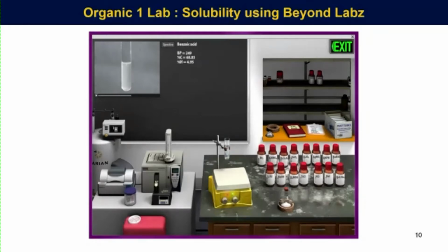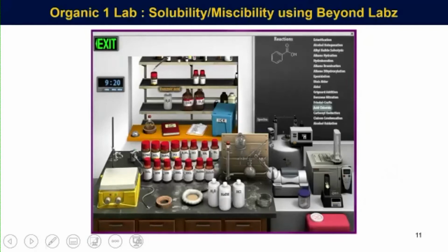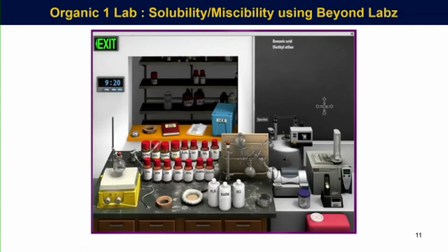And I think I'll be using something like this in the future to set them up for actual work in the lab. So we also built then into an extraction type thing. This is still solubility and miscibility. We've got ether on the shelf, we've got ethanol, we've got water, we've got some different polarities. We've got polar aprotic and polar protic, as we would in the organic lab.